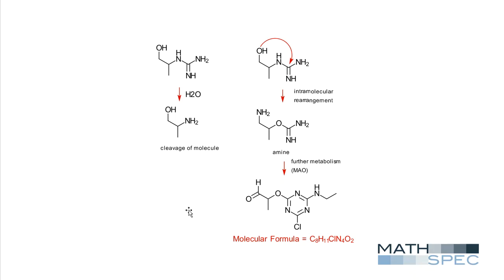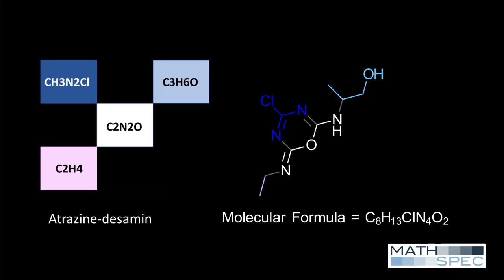So it's very unlikely that the replacement of the nitrogen with an oxygen is done outside the ring system. So replacing the middle nitrogen explains the fragmentation data well for partition 1 and this proposed structure here.